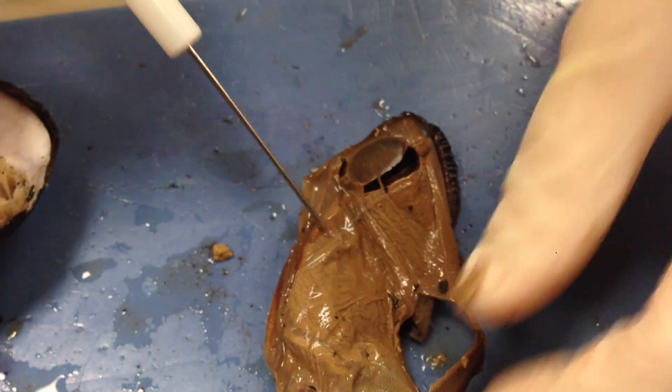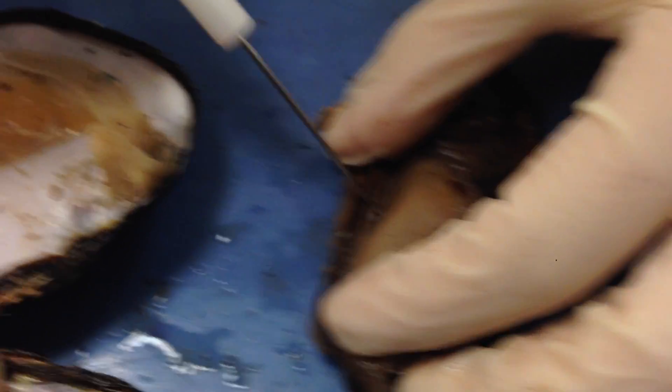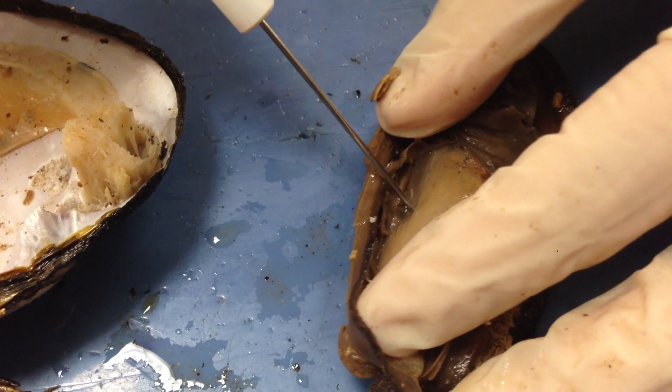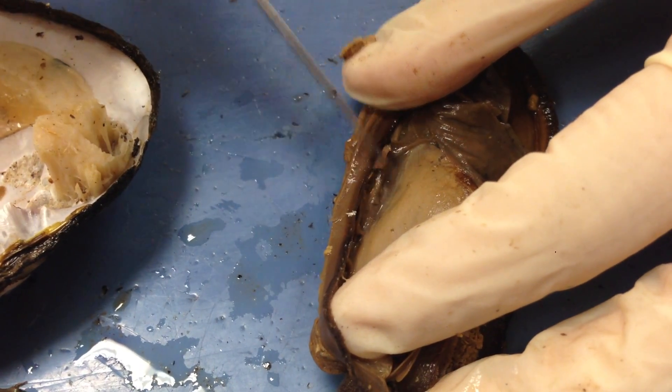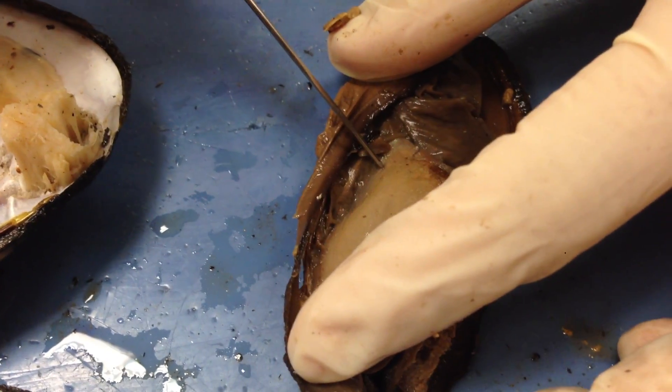And then in this area, if we pull this back again, this is going to be where your heart is. Remember that you have an open circulatory system for these organisms, and so the heart really just is to allow for forward movement of materials flowing through this organism.